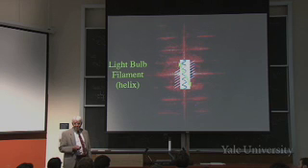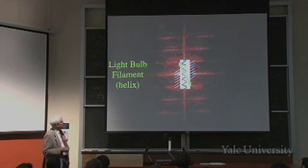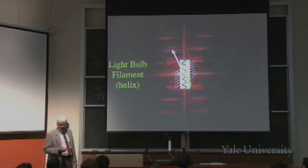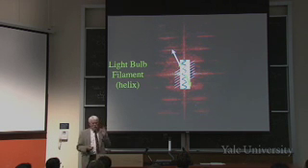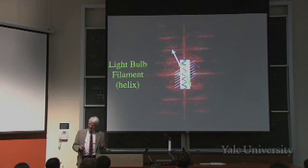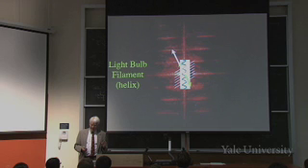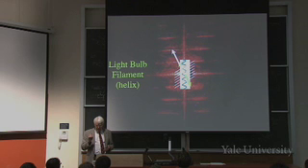Twice as far out. The sign is twice as big, actually, not the actual spacing, but it's that one, the second one out along the branch. Okay? Now, do you expect that to be brighter or not as bright as the first one? It probably will be not as bright.